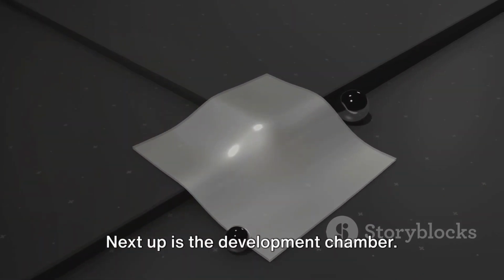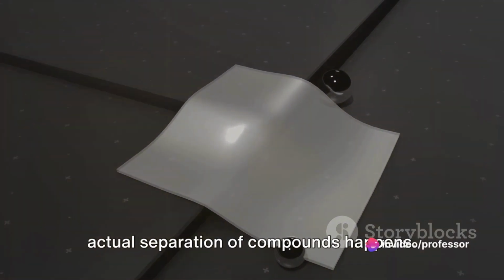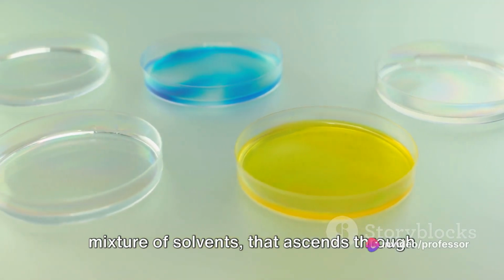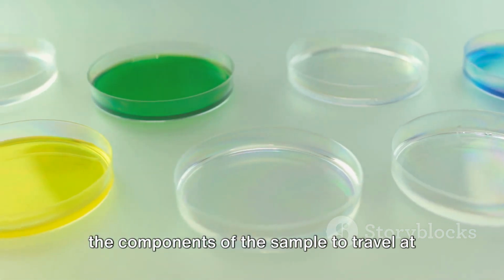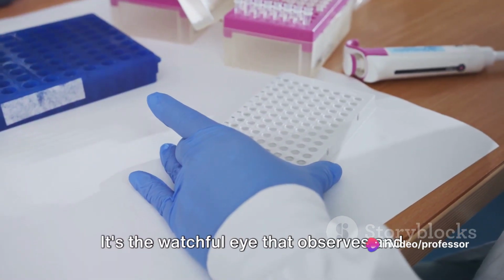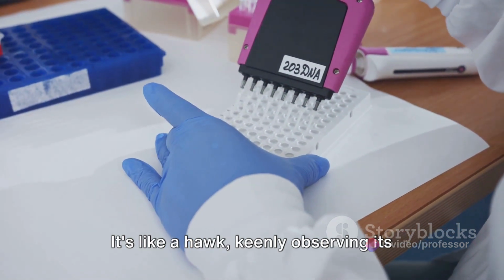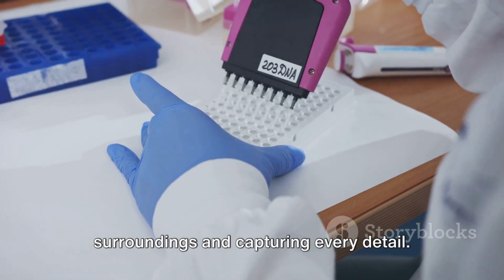Next up is the development chamber. This component is the stage where the actual separation of compounds happens. It's filled with a specific solvent or a mixture of solvents that ascends through the plate due to capillary action, causing the components of the sample to travel at different speeds and thus separate. Then we have the detector. It's the watchful eye that observes and records the migration of the compounds. It's like a hawk, keenly observing its surroundings and capturing every detail.